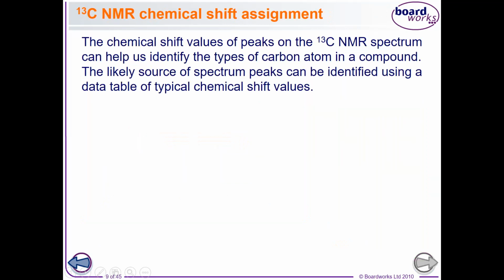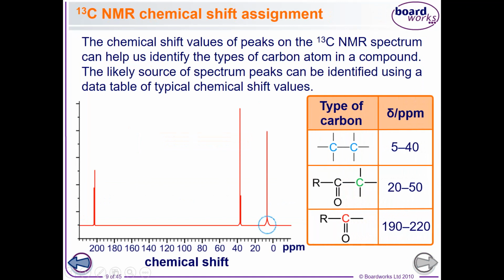Okay, now we're going to look at chemical shifts. We've already been talking about this. All right, here now is a little summary. If you have the carbon directly attached to a very electronegative atom, it's going to be further downfield. If it's attached to a carbon which is attached to an electronegative atom, that's still going to shift it downfield, but not as much. And then clearly, if there are no electronegative atoms, it's not going to be shifted much at all. You can see that peak is very close to zero. Okay, I'm not saying any more. I think we already understand this.